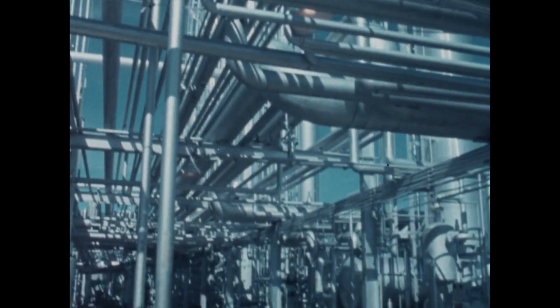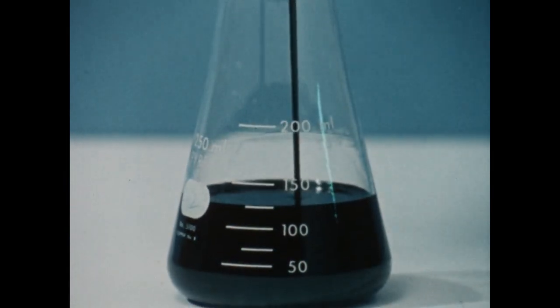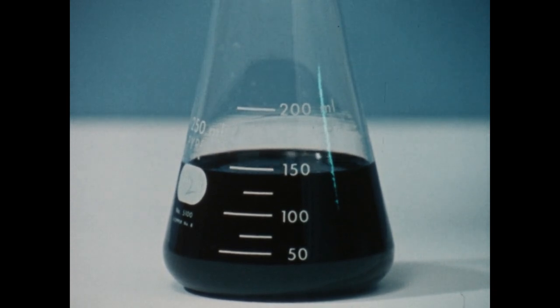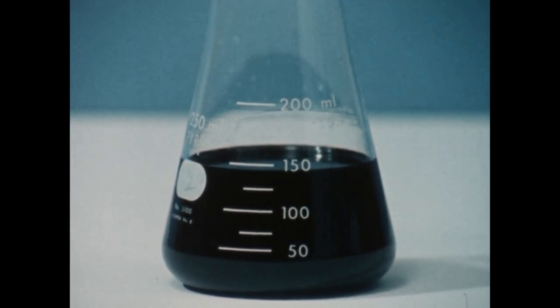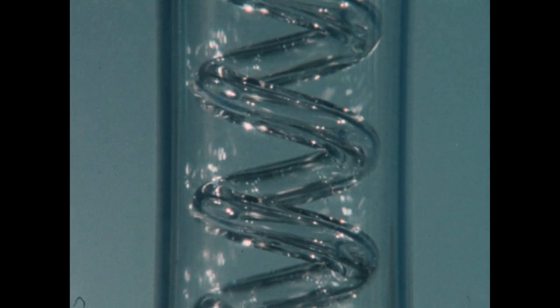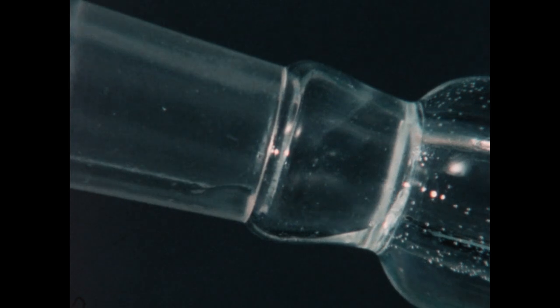This complex process that takes place at a refinery can be demonstrated in the laboratory in a simplified way. The mixture of liquids in crude oil includes gasoline, the jet fuel kerosene, and diesel fuel. And all these themselves are mixtures. The crude oil is heated. Each of the various mixtures boils off over a range of temperatures. In a fractionating column, the various parts of the mixture are separated.